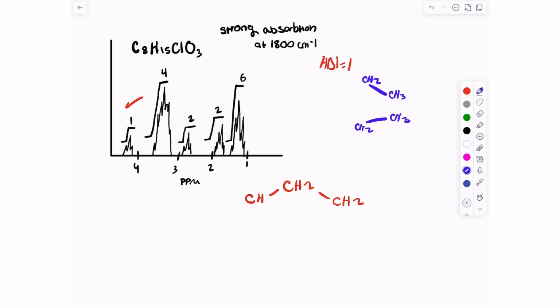And then after we've got that, let's take a moment to count how many carbons we have left, how many hydrogens we have left. So we've used 1, 2, 3 carbons, so we've still got 5 carbons left. 1, 2, 3, 4, 5. We've used 5 hydrogens, we've got that many left, and then we've still got all of our halogens and our oxygens.